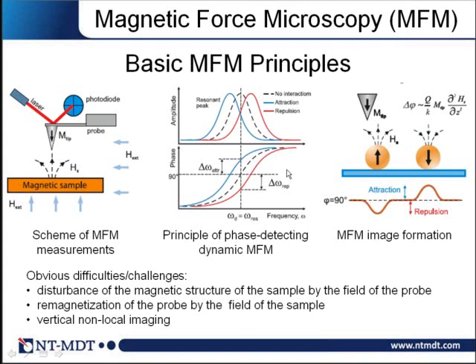I'm also asked about any application of MFM in food samples, biological samples, or metrics. Well, magnetic biology is a very hot topic now. As you probably know, there is the so-called giant magnetoresistive effect, which allows you to determine very tiny magnetic fields.